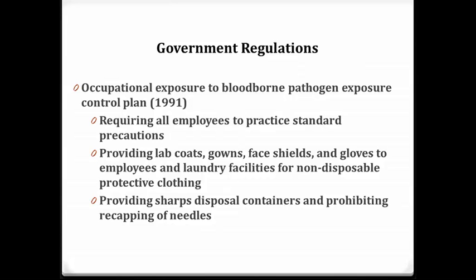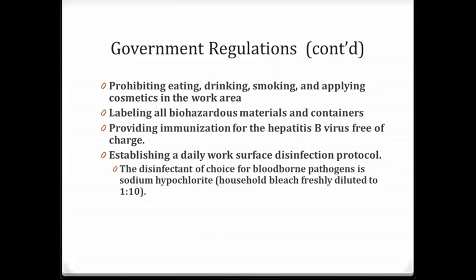There are different government regulations. The Occupational Exposure to Bloodborne Pathogen Exposure Control Plan of 1991 requires all employees to practice standard precautions, provide lab coats, gowns, face shields, and gloves to employees along with laundry facilities for non-disposable protective clothing, provide sharps disposal containers, and prohibit recapping of needles. It also prohibits eating, drinking, smoking, or applying cosmetics in work areas; requires labeling all biohazard materials and containers; provides hepatitis B immunizations free of charge; and establishes a daily work surface disinfection protocol.